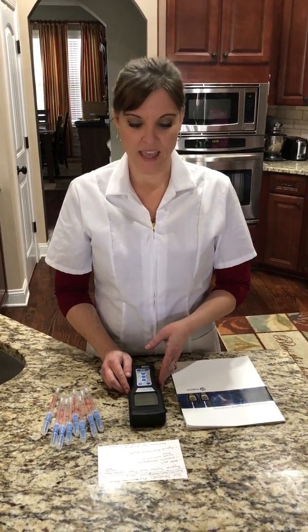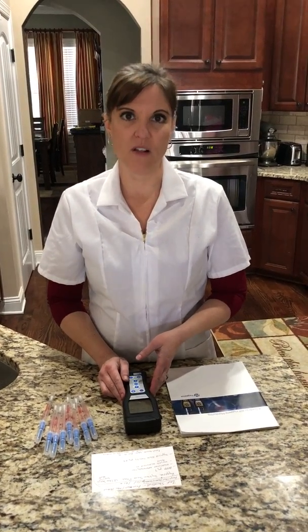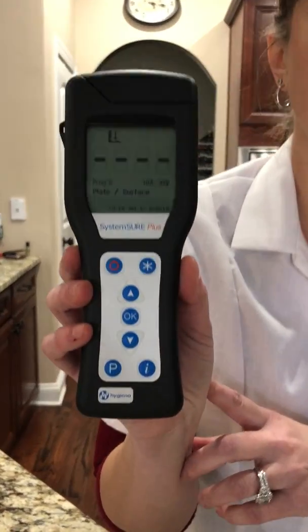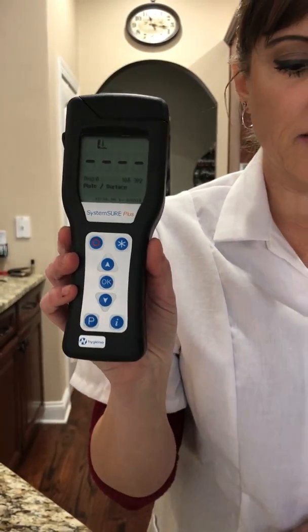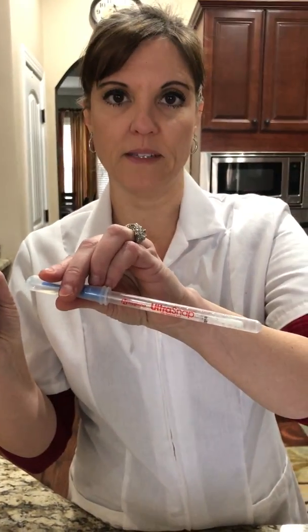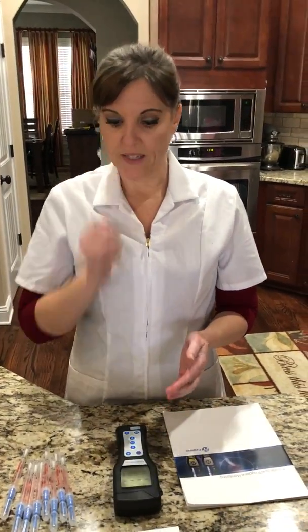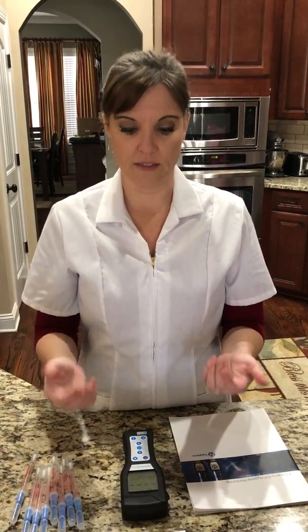Hi, I'm Michelle Vargas and my husband is Bert Vargas. He's a neurologist and he was kind enough to give me for Christmas, because I'm a nerd, the Hygiena System Sure Plus device. This device, along with the ultra snap swab testing devices, measures the amount of residual ATP that is left on any surface, and that is what's going to tell us how clean that surface is.